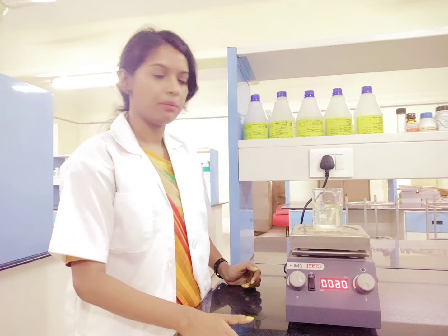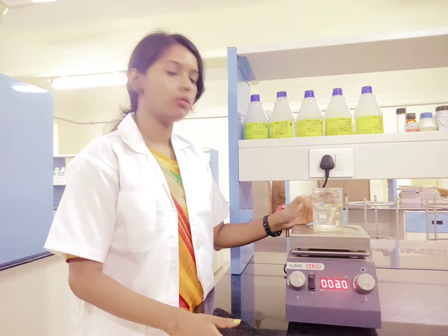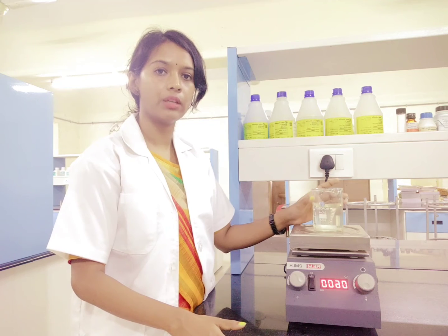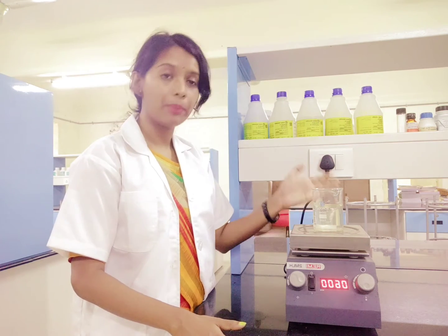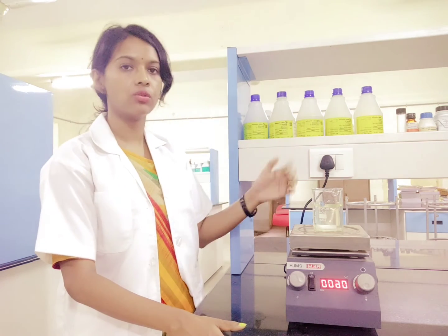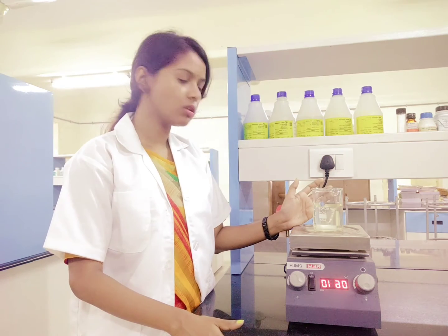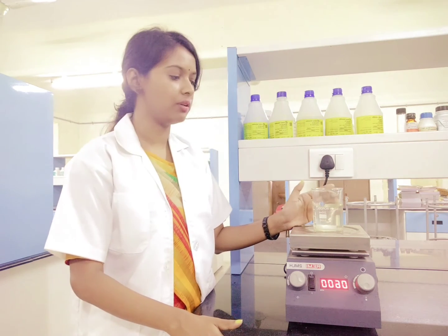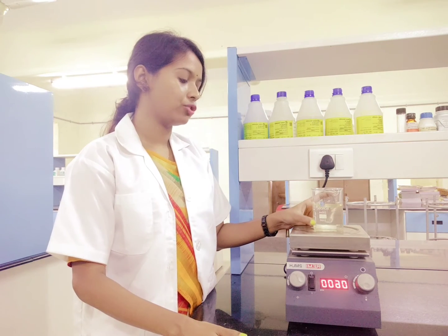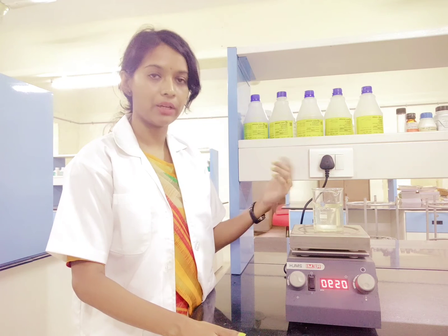One more thing to keep in mind is the placement and the choice of the beaker. Make sure that because of the stirring effect, the sample you are pouring inside the beaker does not spill. The size of the beaker should be a little bigger in comparison to the solvent or the sample that you are keeping for stirring. Also, always make sure you are keeping it centered on the plate in order to have a better stirring effect.